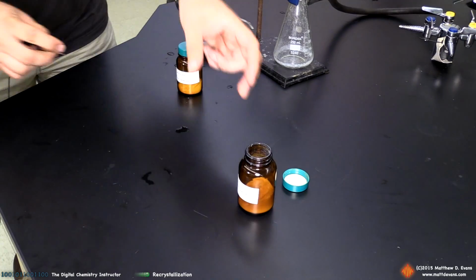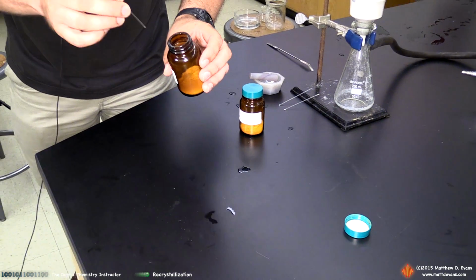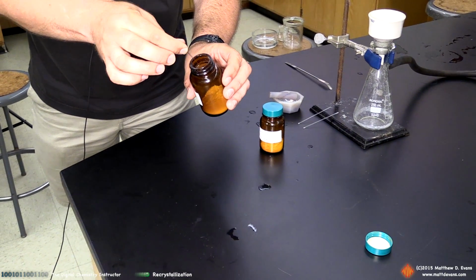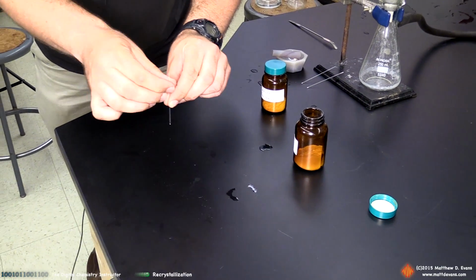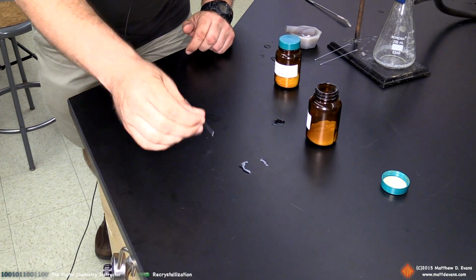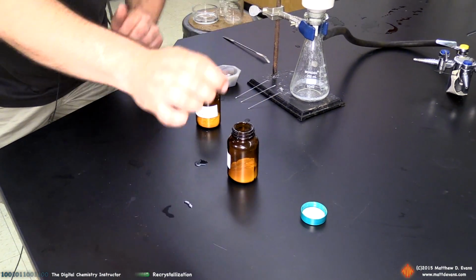And now I've got a store-bought sample of sulfanilamide. I'm also going to prep this because we have it available. And this is pure sulfanilamide, just to check how I did. Okay, I can see it, it's enough. I'm going to put this to the side.